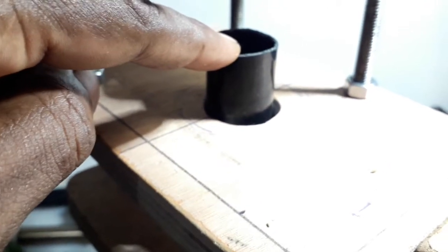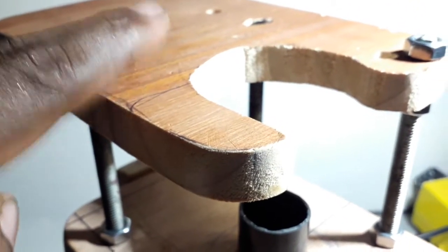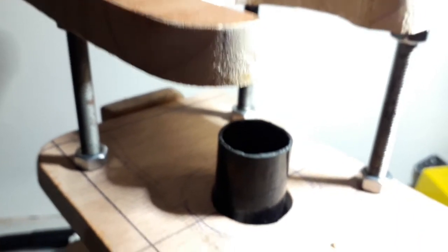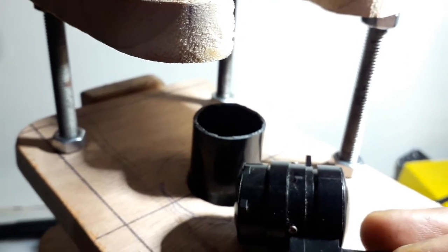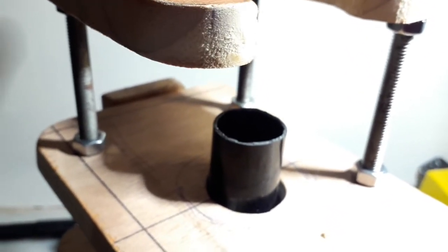Normally it's three pieces, and I look through this hole, but I can also add this piece, which I did last, to place my smartphone flat looking through. Now I don't use my eyepiece as yet when I'm filming. I use things like this. This thing I got from a projector and some other stuff with lenses, because the camera sees through easier.